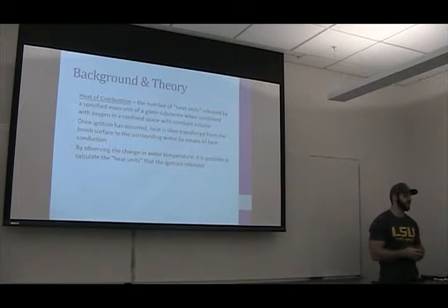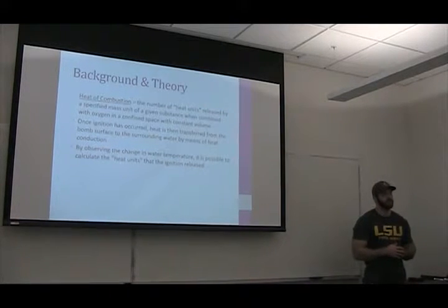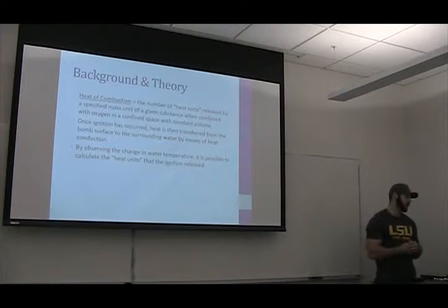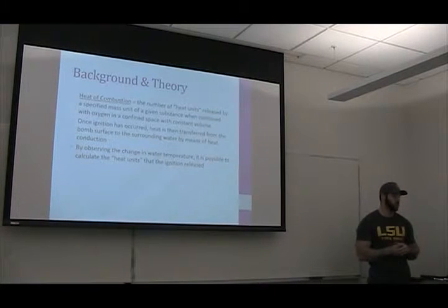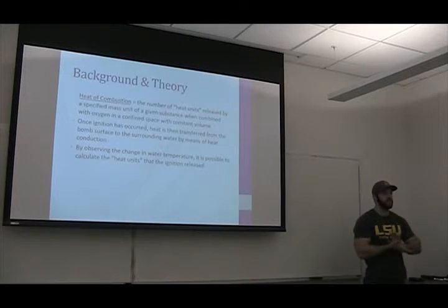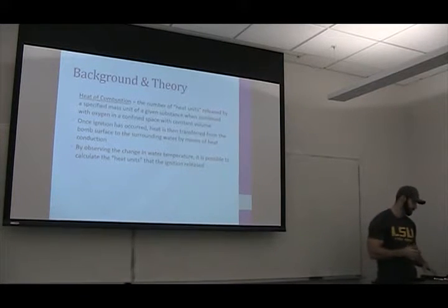So once ignition has occurred, heat is then transferred from the actual surface of the bomb, since there's no more air in it, to the water that is surrounding it by means of heat conduction, and by observing the water temperature and the change that occurs, it's possible to calculate the heat units that were output by the ignition.